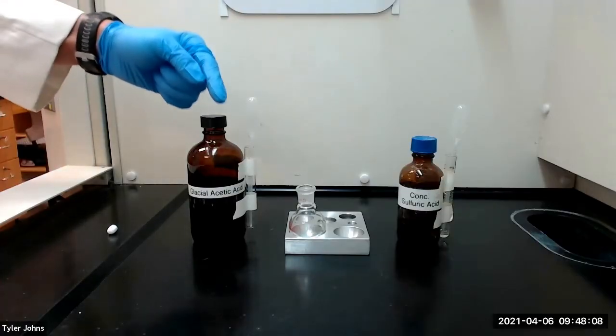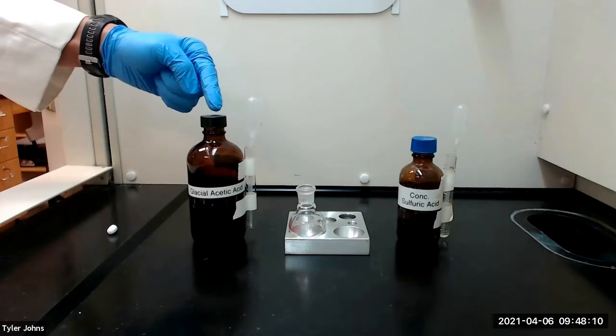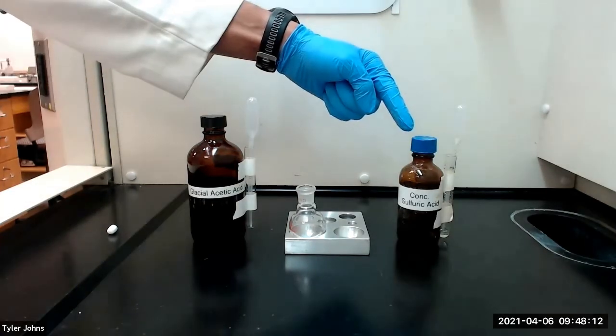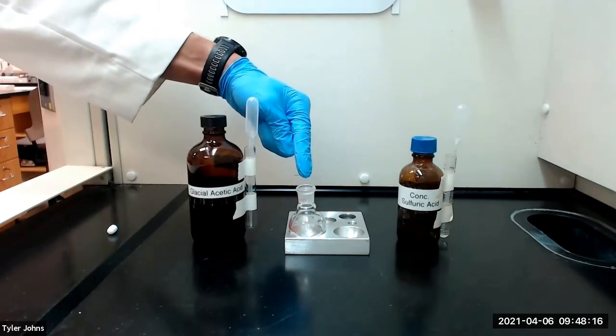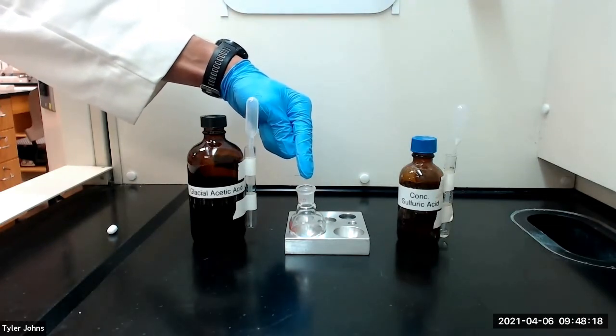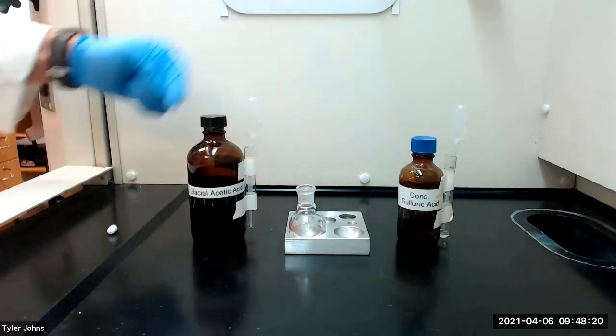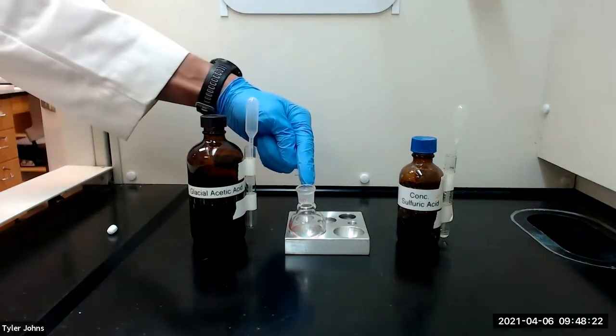We will next add 7 milliliters of glacial acetic acid and 1 milliliter of concentrated sulfuric acid to the unknown alcohol in the round bottom flask and swirl immediately to mix. We will also add a stir bar to the flask.